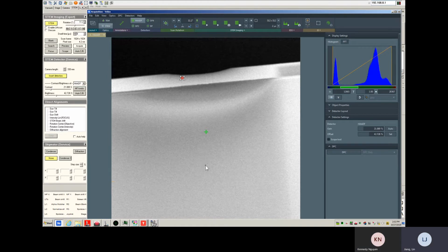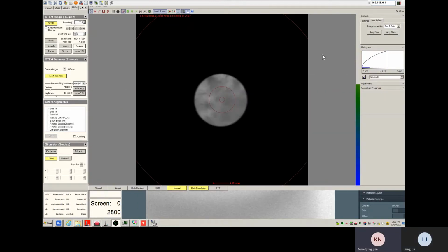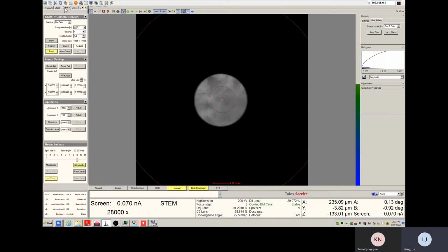Okay. And then you can. Okay. Let's do the. But now they have overlapping, right? Yeah, I don't want to see overlapping. Let's go back to 20.